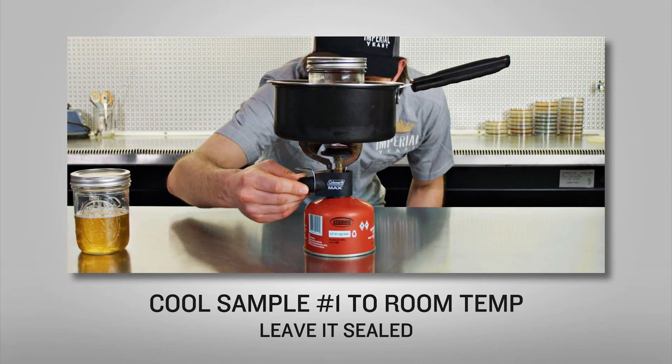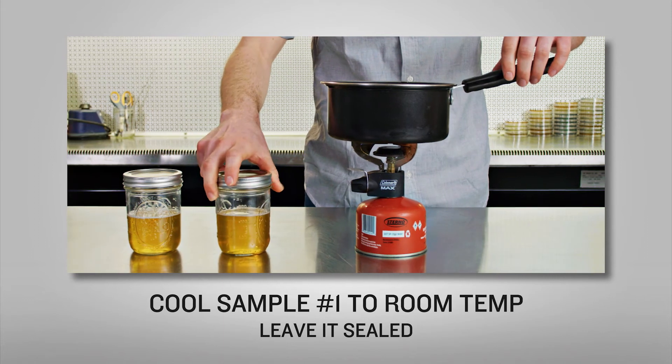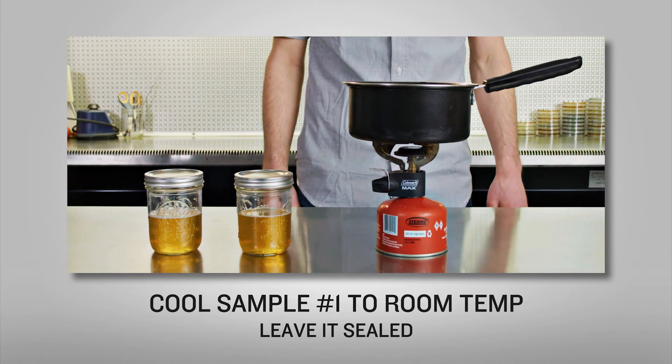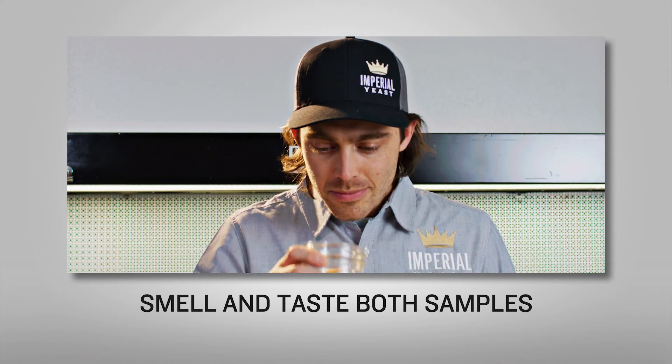After 15 minutes, let the heated sample cool to room temperature, still keeping it sealed. Finally, perform sensory evaluations on both of your samples, starting with the first sample — your heated sample.